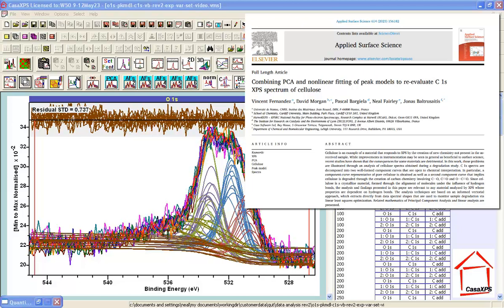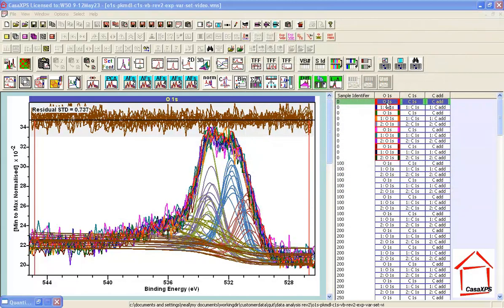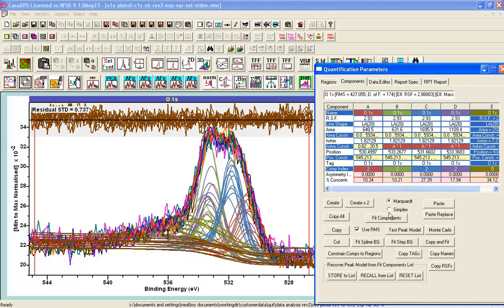When we fit a peak model to data, normally only the particular spectrum is used. However, if we have multiple spectra overlaid in the active tile and each spectrum has a background defined, then the peak model on the first selected VAMAS block will be used to fit all the data at the same time. This is achieved using the Fit Components button.